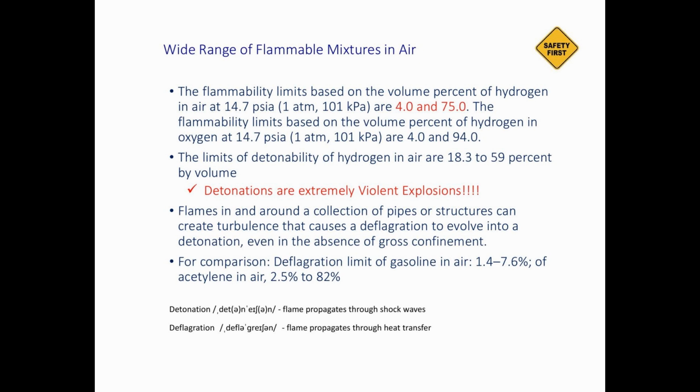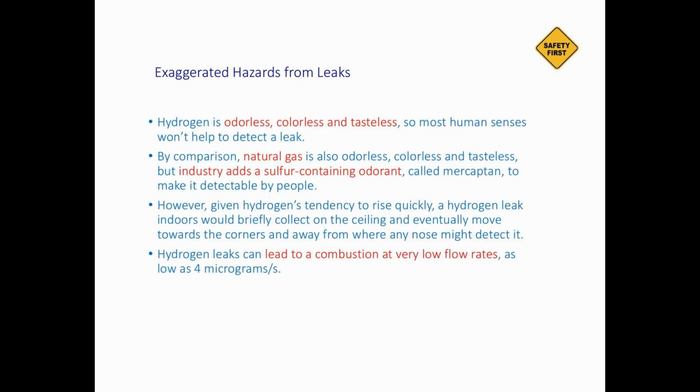You need to know what chemicals you're dealing with. You need to read the MSDS. We work with flammable materials. You can separate oxygen and other oxidizers by rules. Hydrogen is odorless, colorless, tasteless, right? So most human senses just won't help you to detect hydrogen leaks.